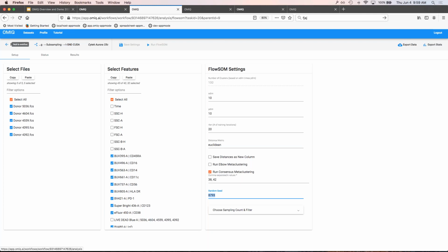And when you do virtual concatenation, it's only for plotting and other sort of dynamic things. So what we do is we virtually concatenate in real time on our server and then display the data to you in the concatenated form. And so usually that's the convenient way to do it. We have permanent concatenation as well. Normally you don't want to use that except in cases where your sample was so large that you had to acquire it over multiple tubes or something like that, and that properly it should be concatenated. For the rest of the time, you just want to use virtual concatenation.